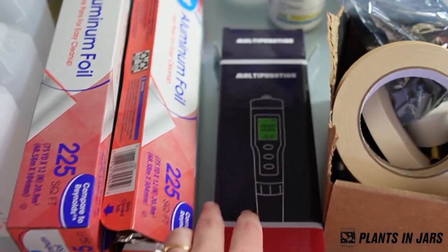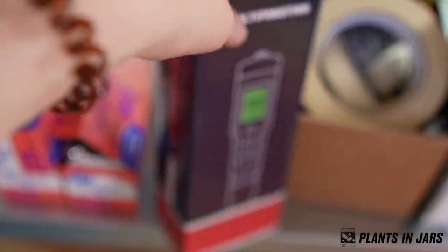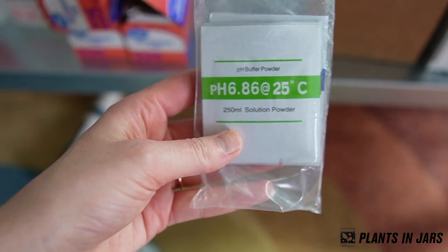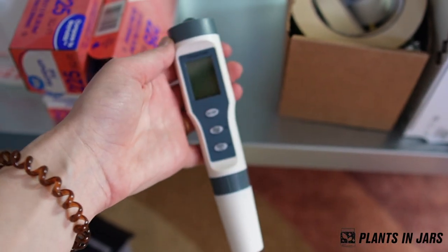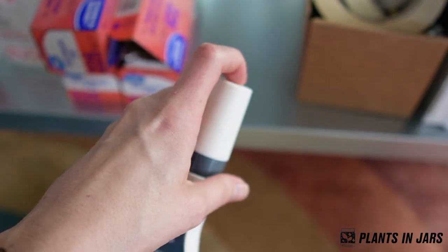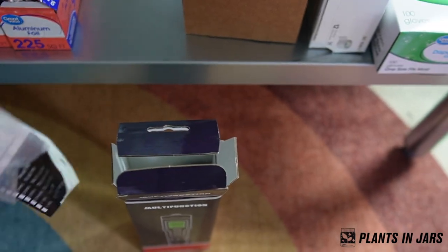I keep this pH reader just in the box because I need the instructions, and I also have the calibration powder in here as well. I have not found a pH meter I like. I started with the Blue Wave one, which I didn't like because you had to keep it wet every week even if you weren't using it, and I knew I was just going to forget to do that, so it didn't really make sense for me personally.